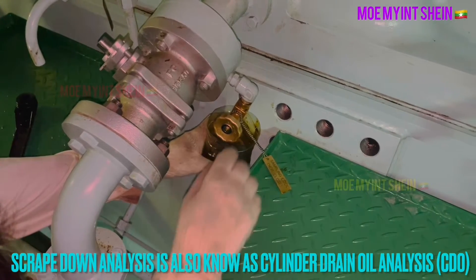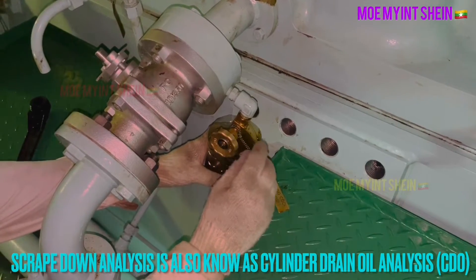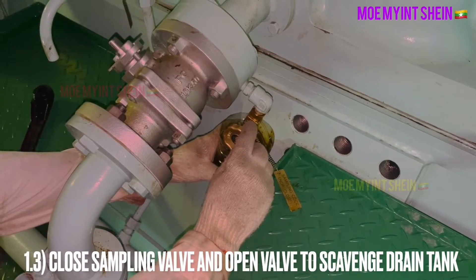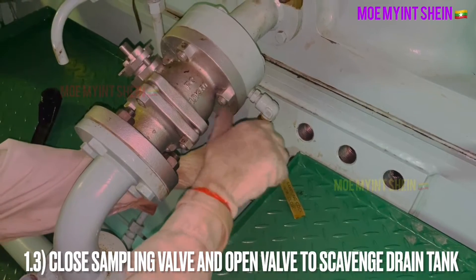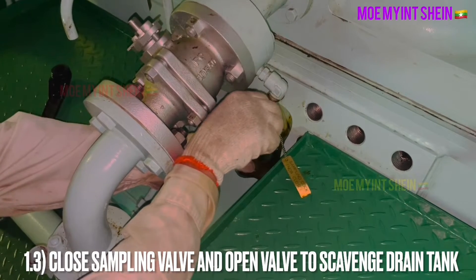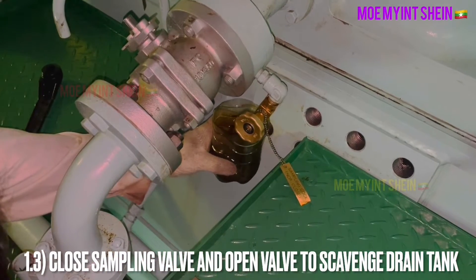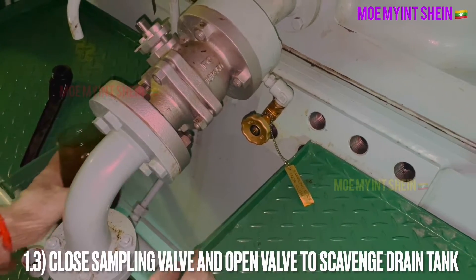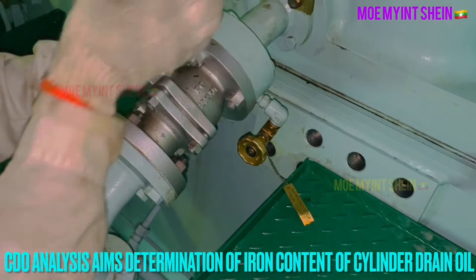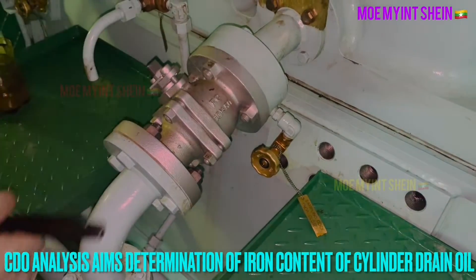Scraped down analysis is also known as cylinder drain oil analysis. Close the sampling valve and open the valve to the drain tank after the required amount of cylinder oil has been collected. Scraped down analysis is carried out to determine the iron content of cylinder drain oil.